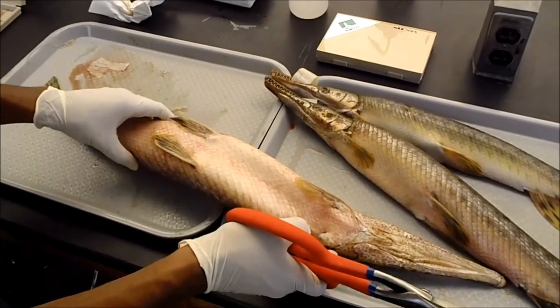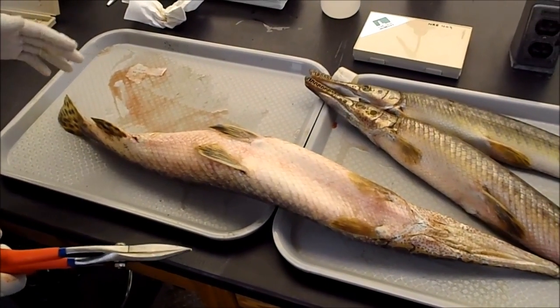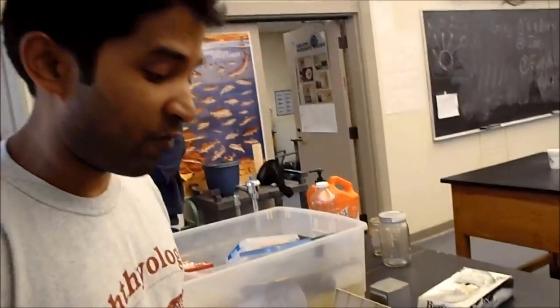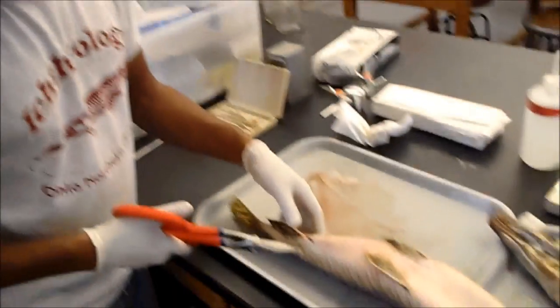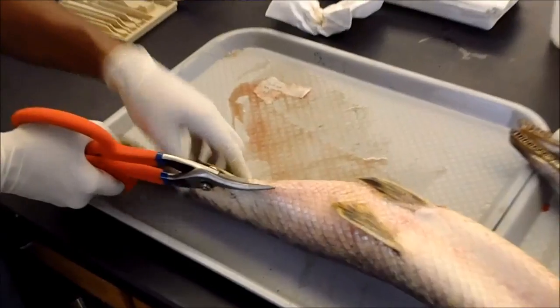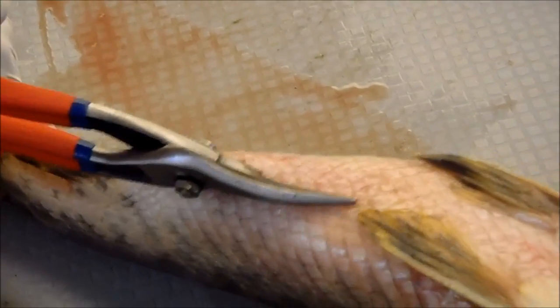First we're going to identify the sex of the fish. We can't identify the sex externally, so we have to cut them open. We're expecting a spotted gar this size to be female, so we have to use tin snips to cut through and slice up here to get into the body cavity.